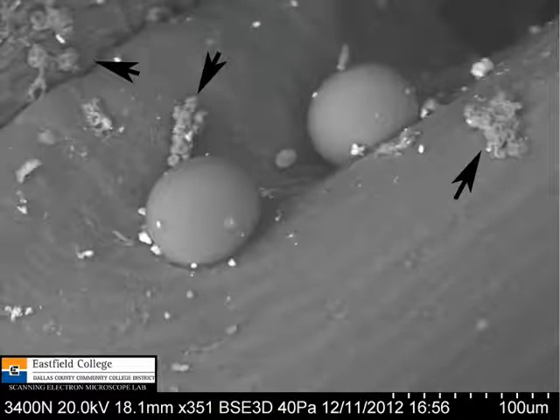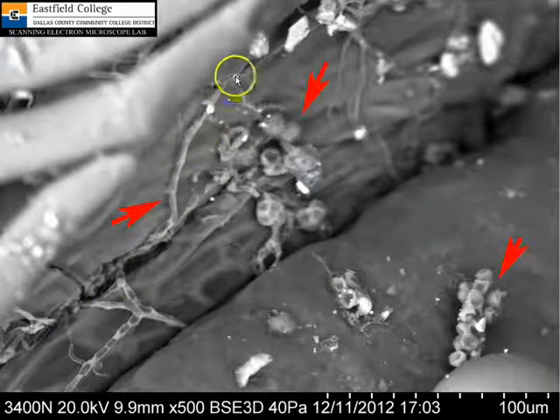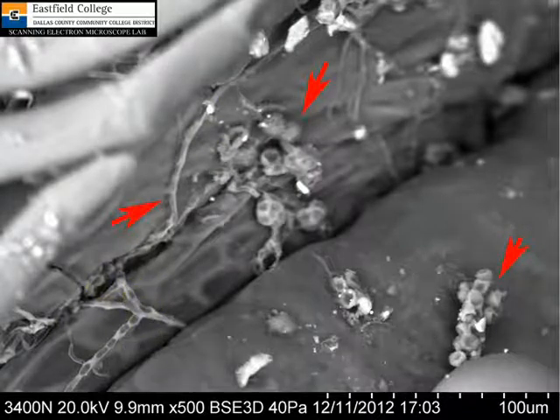When I was looking at a close-up view of the little beads of sap on the leaves, I did notice that there was something else on this pine tree, my little Christmas tree at home, and that there's a fungus growing there, and you can actually see some of the spores from the fungi I've indicated with the black arrows here. And a closer look at some of the spores, and then this is actually a little hypha. This is what makes up the body of the fungus here. So my little Christmas tree, I've not only bought the Christmas tree, I also bought a fungus for Christmas.